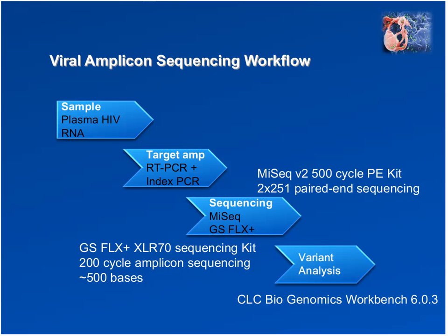So we'll do one more to wrap this up, and I will choose this one that says, do you have a recommendation for analysis software suitable for handling deep sequencing data? Well, I would recommend the CLC Biogenomics Workbench, simply because I have experience with it at this point, which I acquired because it has all of the tools that we who are doing this kind of work need.